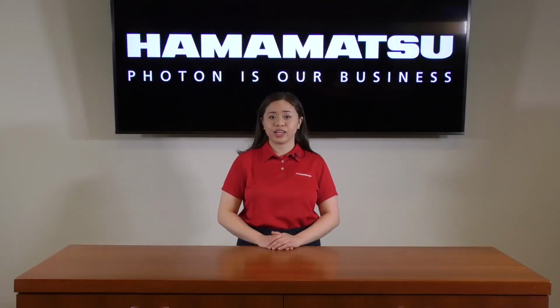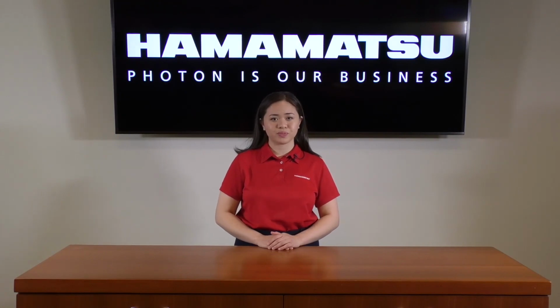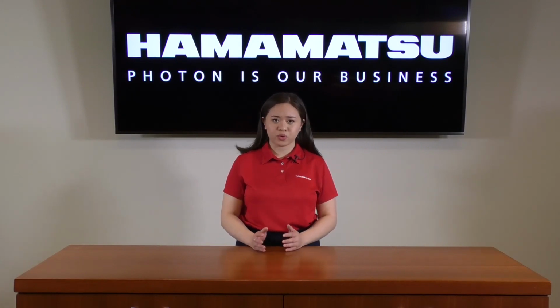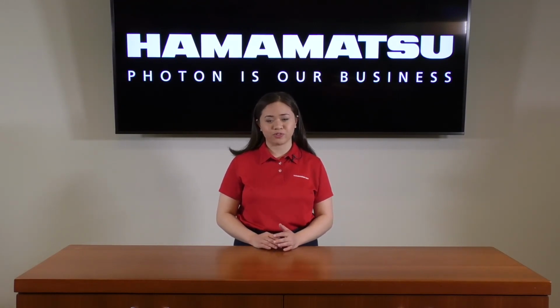Working in the NIR can allow you to avoid issues that are typical of other spectral ranges. In the visible range, light leak can impact measurement accuracy, and in the UV range, UV radiation has the potential to destructively impact samples. So with the NIR range in focus, where within this range is most important to you? Since each compound reacts differently, we suggest doing research in the literature to find out what absorption or emission spectra exist in this range for your sample. From here, it becomes possible to match the spectrometer's range of sensitivity to that of the sample of interest.